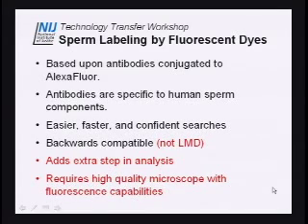And what's even more important, how many times have you looked at a slide for a long time and you're just not sure there's nothing there? You look at it, you don't see anything, and you walk away from it, and you never saw any spermatozoa, but you decide to go ahead with the process, you run the process, and now all of a sudden you get a nice profile in your sperm fraction. Anyone ever had that happen? Or do y'all stop after not finding sperm? So now, with this fluorescent labeling, I believe you have more confident negatives and more likely to find some that have positive samples on there.